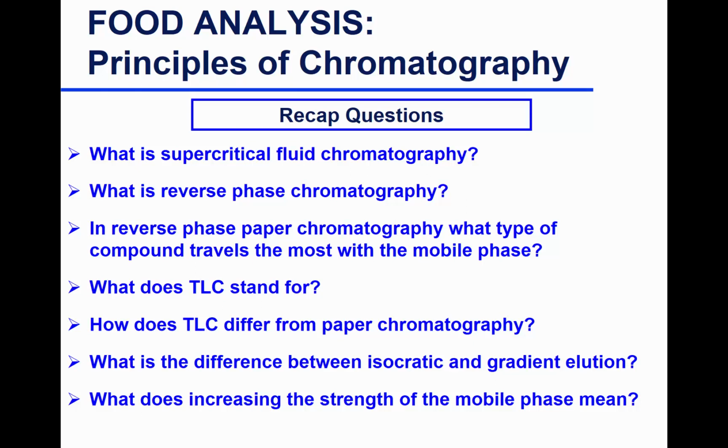What do we mean when we say increasing the strength of the mobile phase? Hold on, let's see if anybody else. What does it mean, increasing the strength of the mobile phase? Okay, go for it.